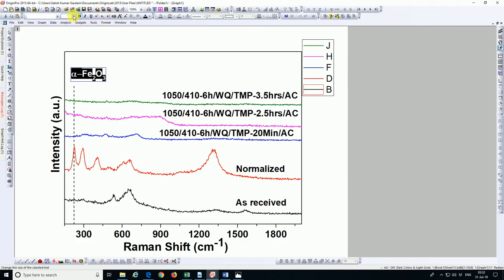You can change the font size, and if you want to put it vertically, how can you do that? First of all I should change the font size to 16, so that I can draw the other line.